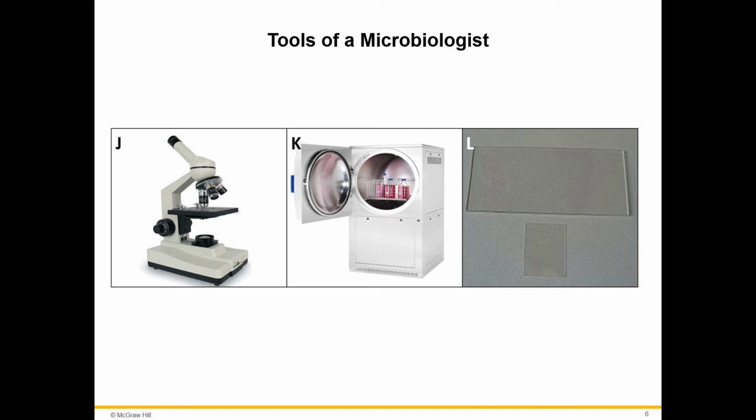In a hospital, they may use an autoclave to sterilize surgical tools. In a microbiology lab, we use this to sterilize culture medium. When we use broth media, we want it to be sterile before we start our experiment. When it's done, we also want to sterilize it so that all of the bacteria or fungi that we grew are killed so that they don't have the potential to spread around the lab. So this is kind of like a sterilization chamber.